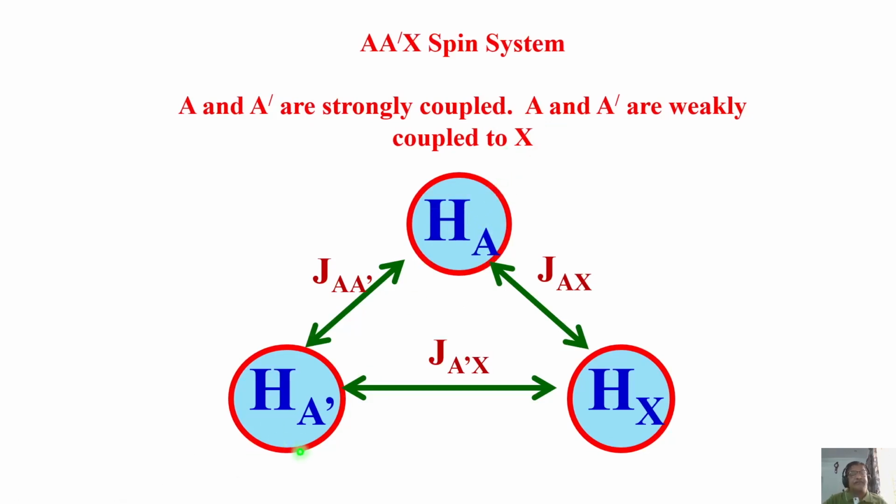The chemical shifts are the same, and there exists a coupling between them which is visible in the spectrum. You got the point? If the chemical shifts are the same and couplings are not visible in the spectrum, it is a strongly coupled A2. But in this case, chemical shifts are equivalent but couplings are visible.